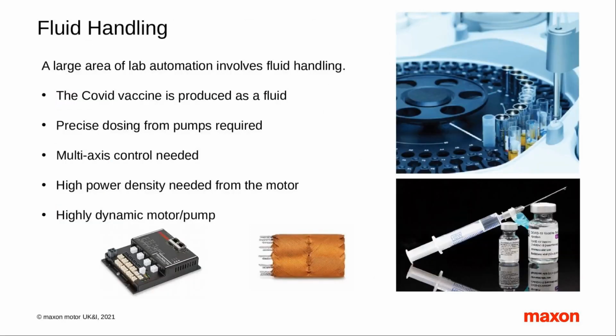So why is all that important regarding motors? Well, within a lab, an automated lab, often the motor would be bolted to a pump to move fluid around the lab. Whenever we switch the telly on, you see the COVID vaccine. It's a liquid inside a little glass vial. Those vials are handled through total lab automation. So they're filled and capped with automated processes.